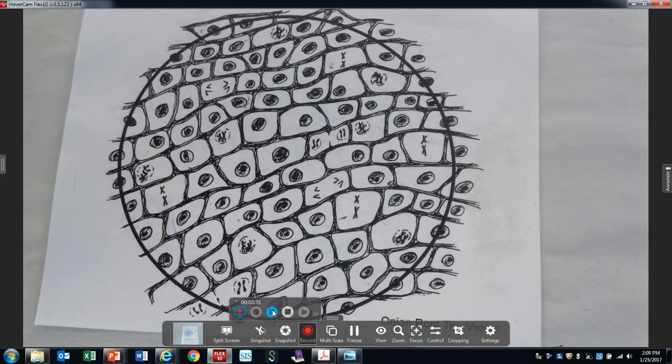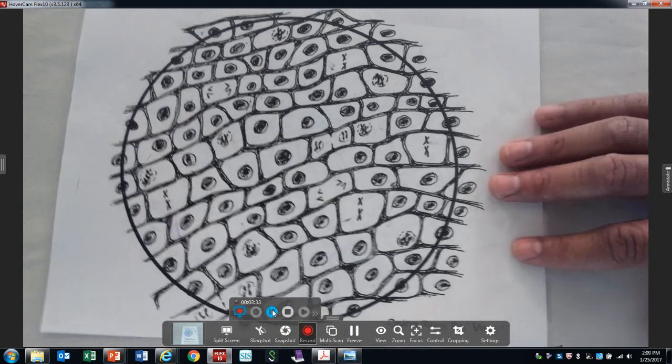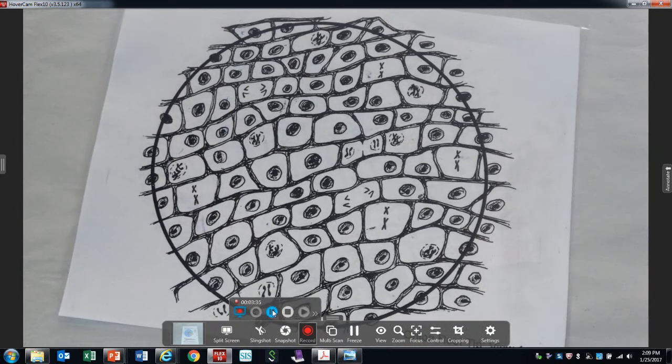All right, I've been asked this question by a couple of you, so let's see. I'm going to go ahead and point. Tell me, this first row, what is this? Follow the mouse. Interphase. What about this? Prophase. How do you know it's prophase? All right, 2 ways. You can see this nuclear membrane starting to disappear, and right? You can see the chromatids.